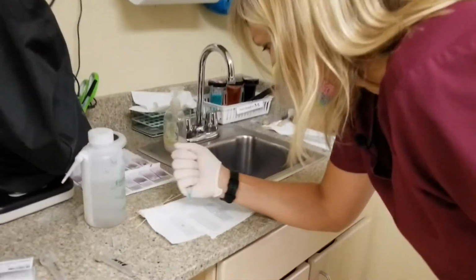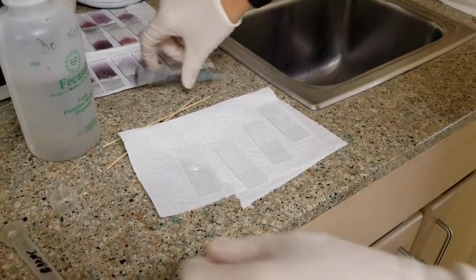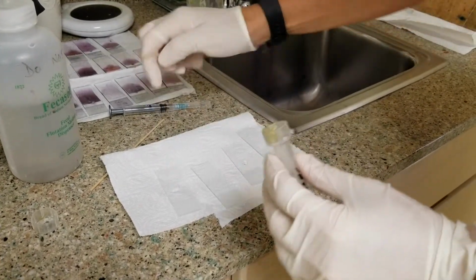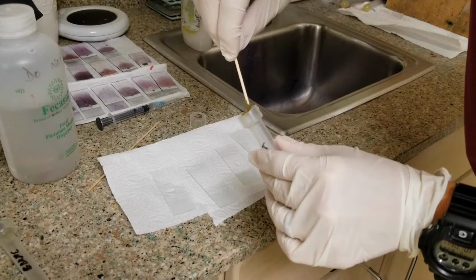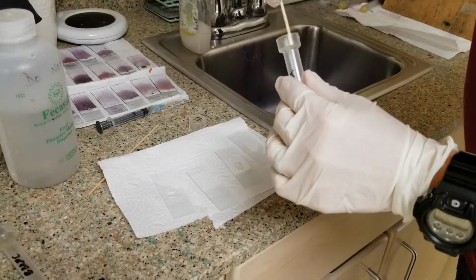So I'm going to set up a direct here. We've got saline or distilled water, and you just need a tiny amount of that feces. You don't want to see it. If you can see a bunch of feces on your direct, you have too much on there. So you can see the hawk barely has any here. And so this is going to be our direct.